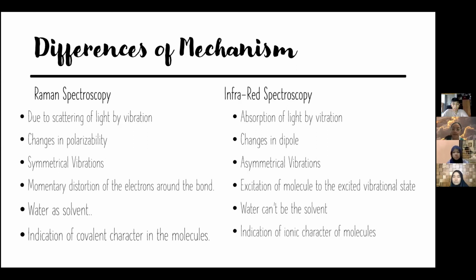the excited vibrational state. The solvent in Raman spectroscopy is water, while infrared does not use water, and uses organic solvent. Lastly, Raman spectroscopy indicates the covalent character of the molecules, while infrared also gives an indication of character, but it's more of an ionic character for the molecules.